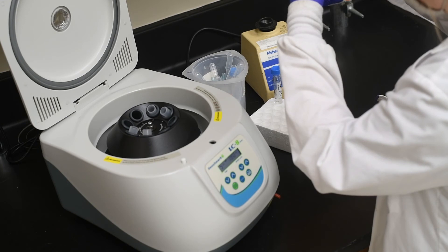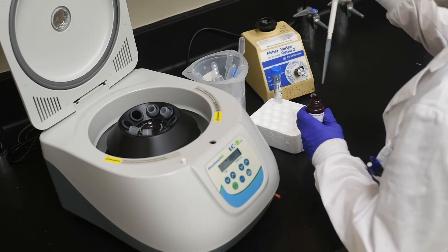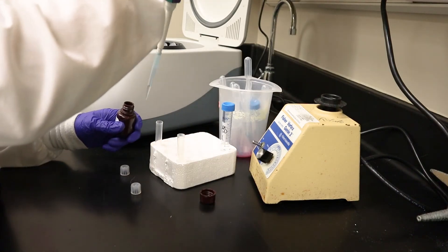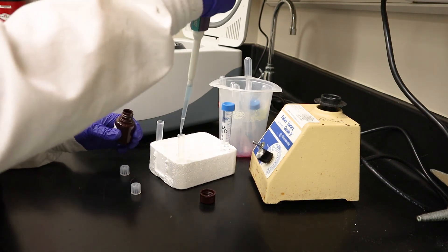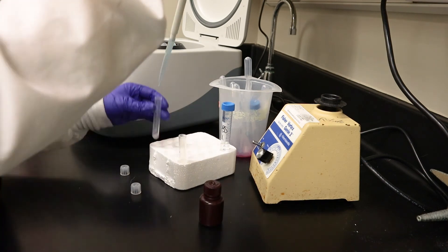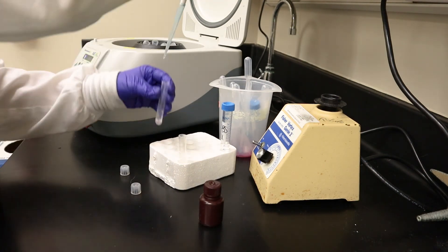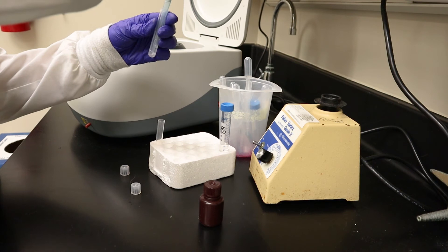Once the tube was empty with only the pellet present, I added 200 microliters of the Muse cell cycle reagent. I triturated my cells within the reagent to resuspend them and then placed them into a drawer protected from light for 30 minutes.